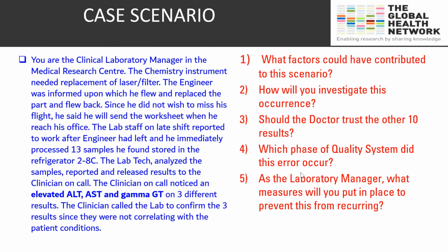Sorry, Kenneth, do we have a yes answer? Okay, yes answer. How many? One said yes if the IQC results are within the indicated ranges. That's a good answer, by the way. If the QCs were run and they're within range, then the doctor should trust this result. I agree. That's a good answer. If it's just yes, the answer is no. But if the person has given yes and qualified it and said that if the IQCs were within the range, then you should go ahead and release the results. I agree. That's true.